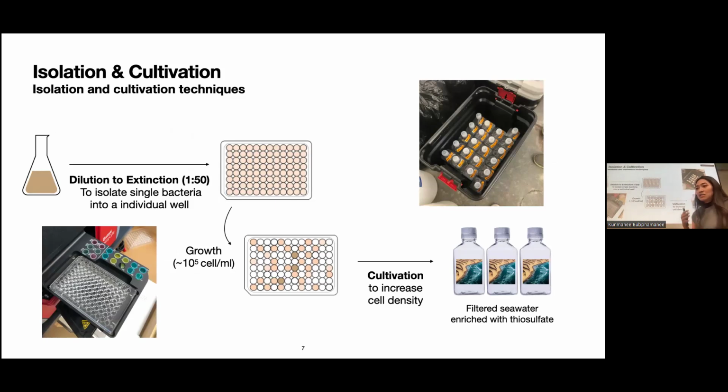So basically, the seawater will progressively dilute it until a single microorganism stays in each individual well. After a while, some will grow, some will not make it. From this microwell plate, I think each well is about 1.5 mL, so it's pretty small. And we have multiple wells.